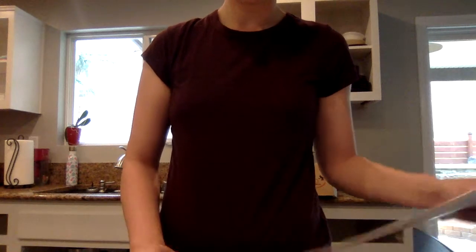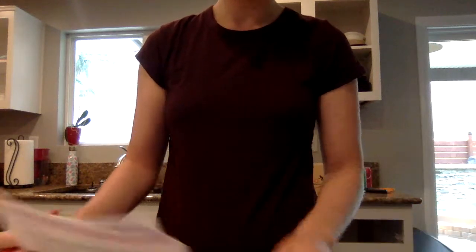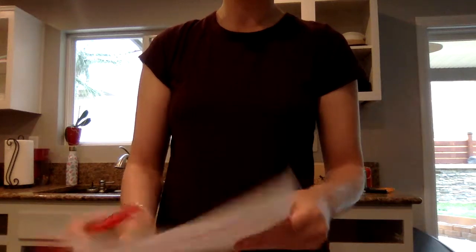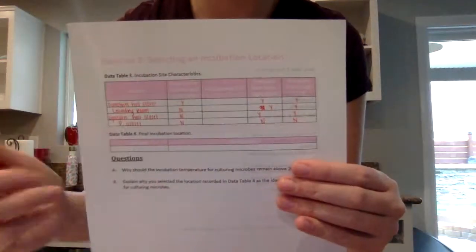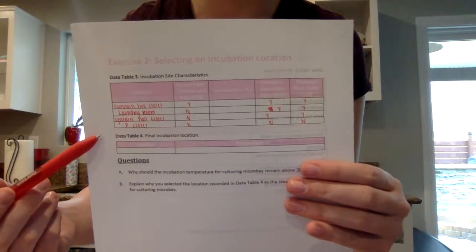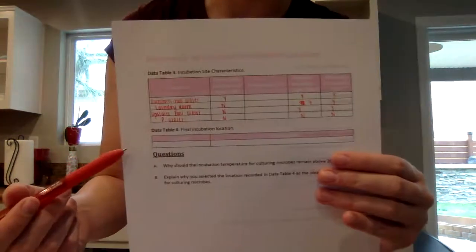The next exercise for week 1 is going to be the incubation site. So I've already listed some places here. I have the downstairs hall closet, laundry room, upstairs hall closet, and my personal closet.